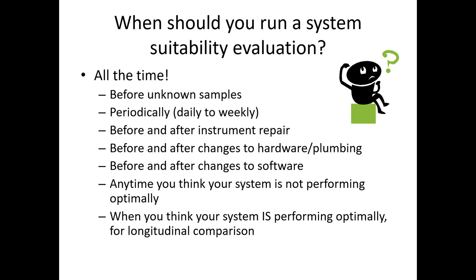And then also, you want to make sure you do it when you think your system isn't performing well. You sometimes get that feeling like, oh, that result that I got for my data-dependent run, it wasn't exactly what I thought it was going to be. Let me look at the last system suitability run that ran before it, and I'll run one right after it and see how they compare.